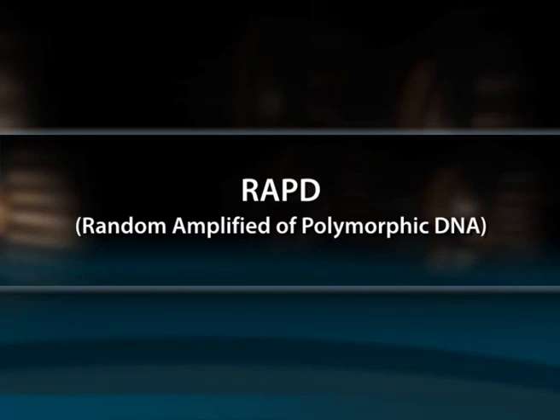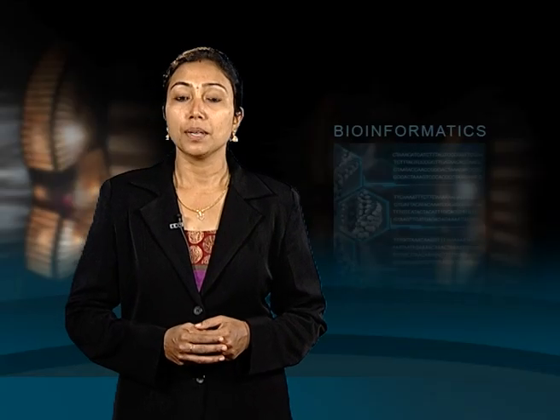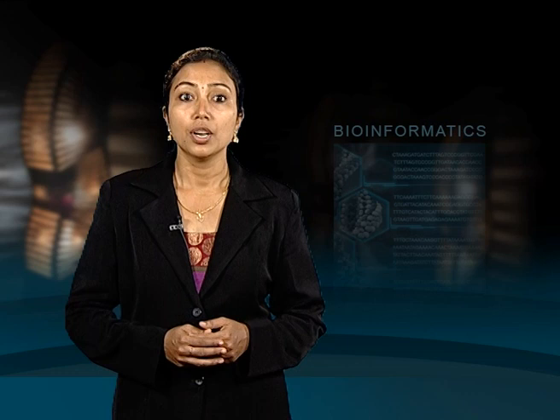Random amplified polymorphic DNA, or RAPD. RAPD markers are DNA fragments from PCR amplifications of random segments of genomic DNA with a single primer of arbitrary nucleotide sequence. Unlike traditional PCR analysis, RAPD does not require any specific knowledge of the DNA sequence of the target organism.